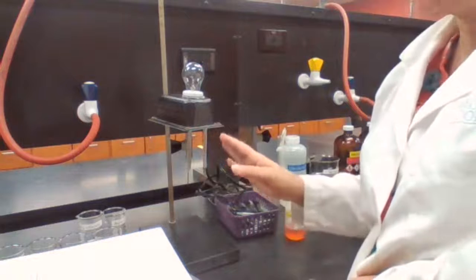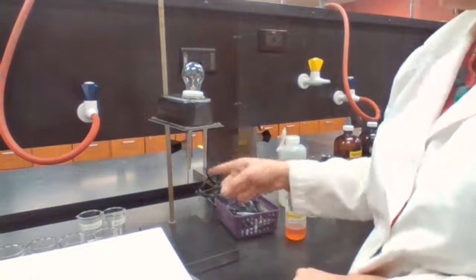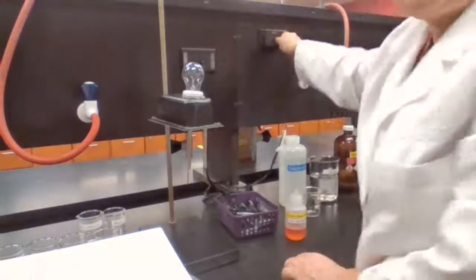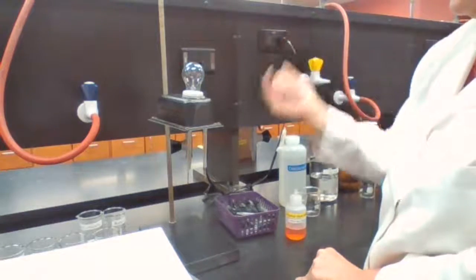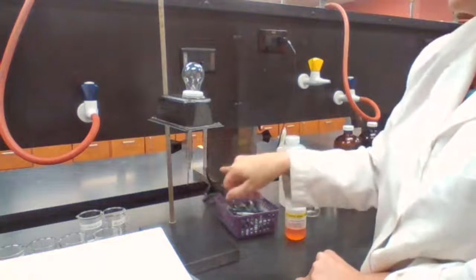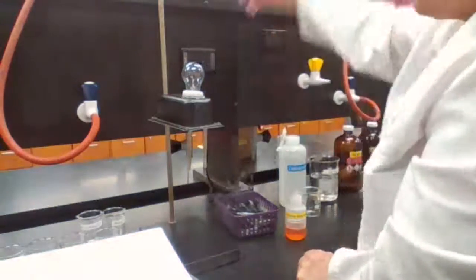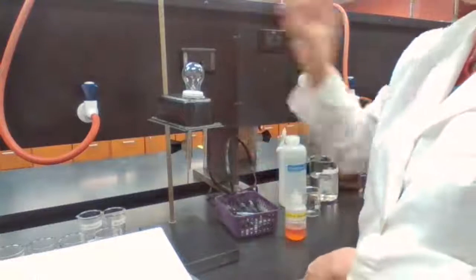Air is a good insulator, so it's not going to move the electrons from one to the other. If I plug this conductometer into the wall power now, you see the light bulb is not turning on. Even though electrons are in one pole, they are not transported into the other pole, so it's not lighting up. If we have a medium here that is an electrolyte, it will move the electrons and the light bulb is going to light up.